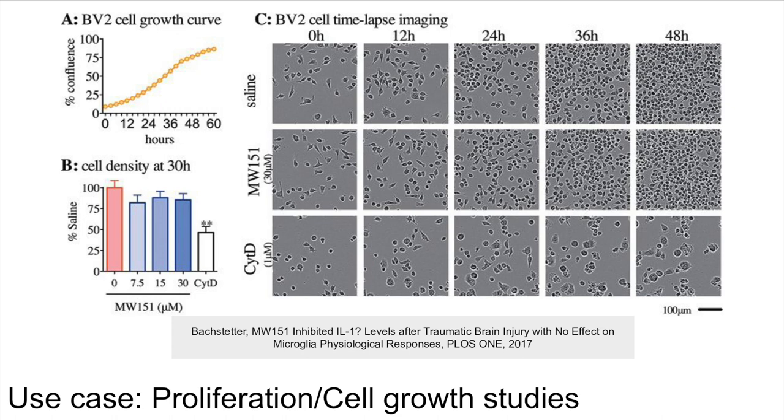In this example, we see a study showing a cell line in three different experimental conditions, imaged every few hours. We can see a difference in count and also phenotype.